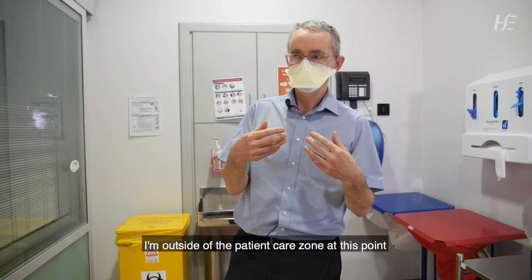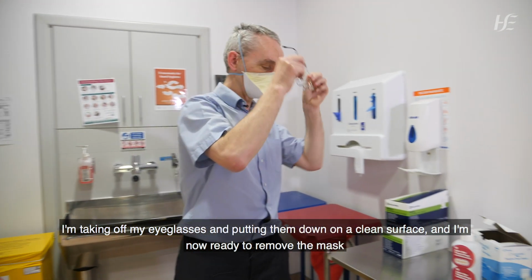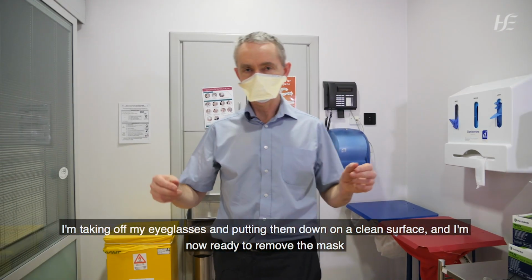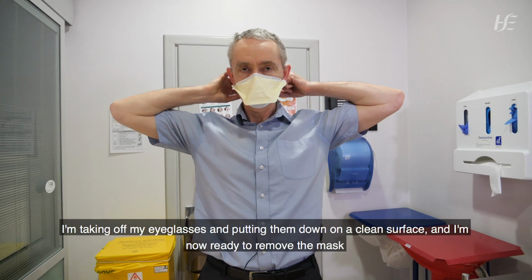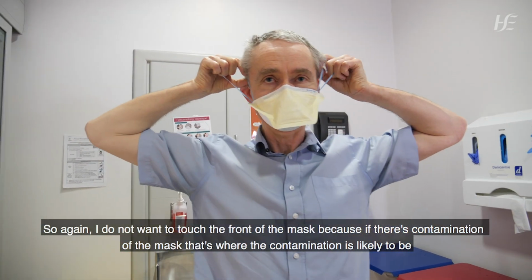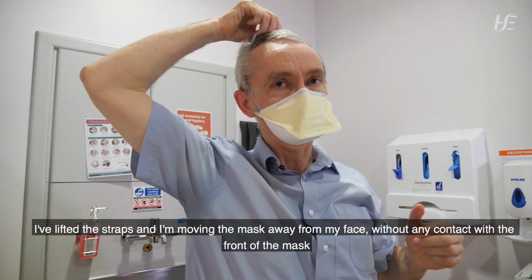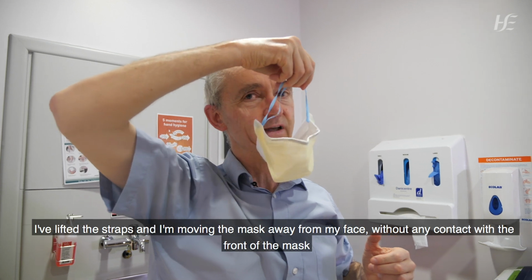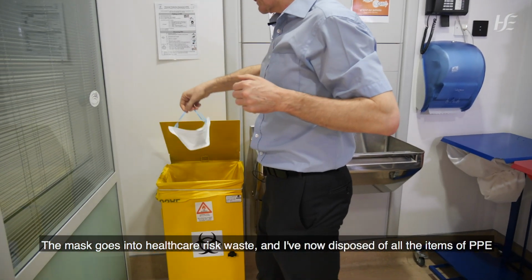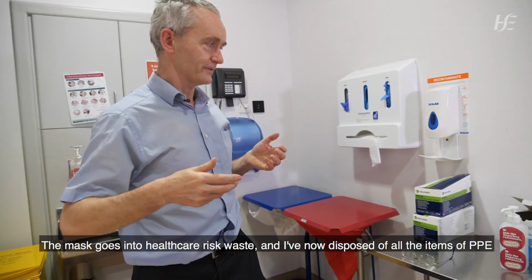So I'm outside of the patient care zone at this point. I'm taking off my eyeglasses and putting them down on a clean surface. And I'm now ready to remove the mask. So again, I do not want to touch the front of the mask, because if there's contamination of the mask, that's where the contamination is likely to be. So I've lifted the straps and I'm moving the mask away from my face without any contact with the front of the mask. The mask goes into healthcare risk waste, and I've now disposed of all the items of PPE.